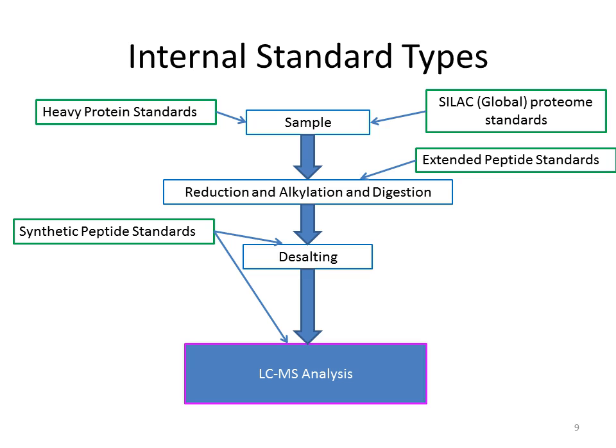Of course, when you're generating a standard, you need to qualify it, make sure that all of those masses are added in, and then figure out how much of it there is. So that's a reference to look up. If you don't have synthetic peptide standards that are heavy labeled for every analyte, you can use, let's back up.